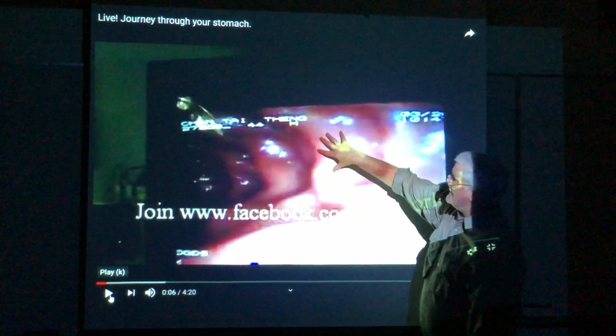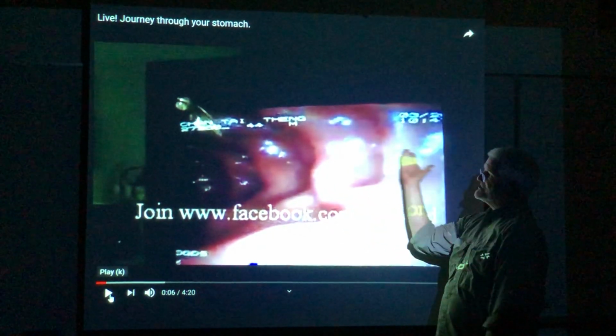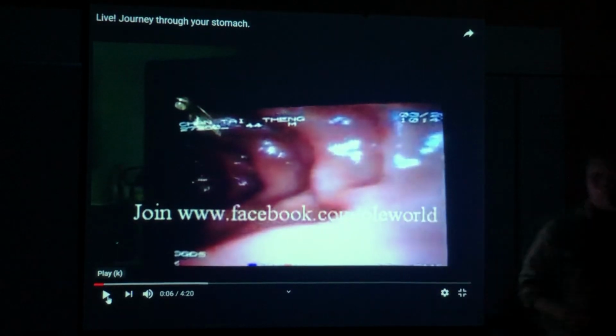Now we haven't gotten there yet, but I want you to notice these little wall or pleat-like structures. Those are going to be permanent because we're in the small intestine. That's how we know it's small intestine. We're going to call them plicae circularis. We have a slide for it. Don't worry about them just yet, but notice these folds are in here. And they're not going to go away. They're permanent.